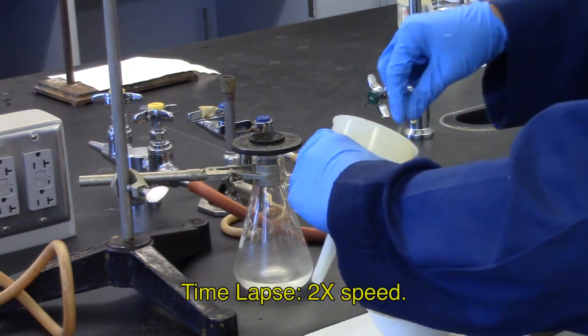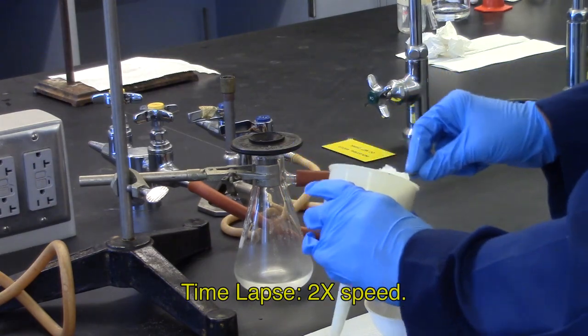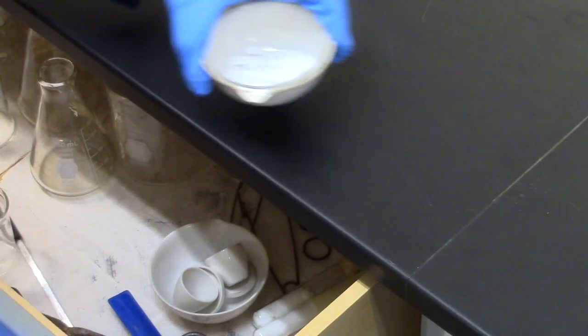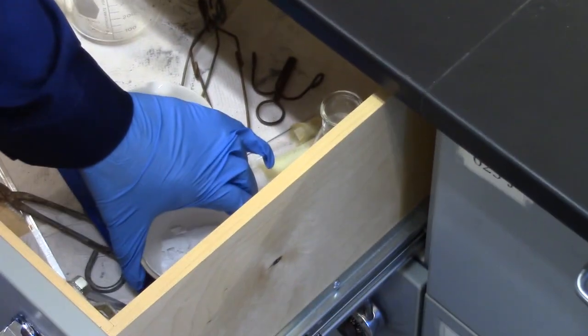To do parts B and C, you will need about 1 gram of product. Store your sodium hydrogen carbonate in a beaker or evaporating dish in a safe place in your locker.